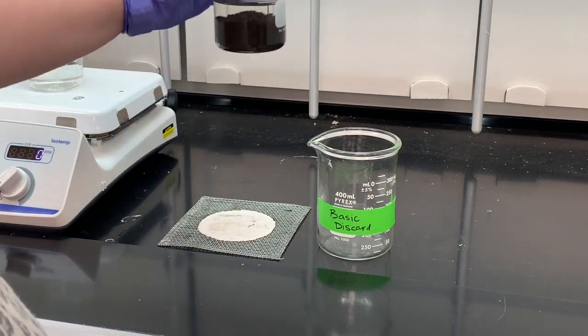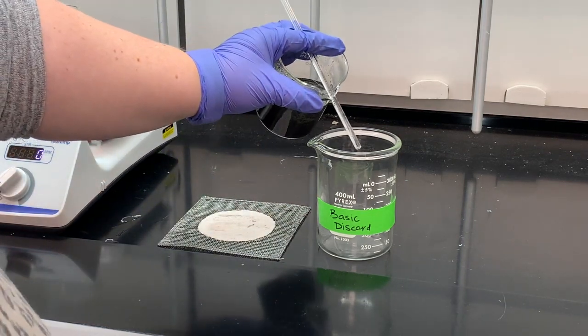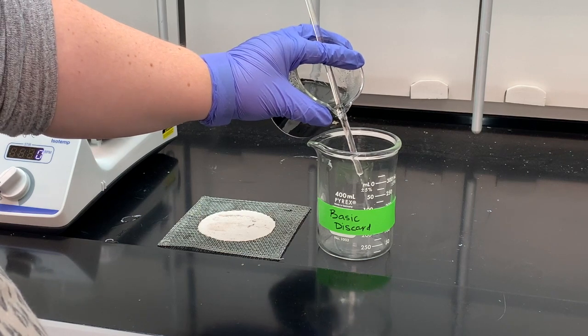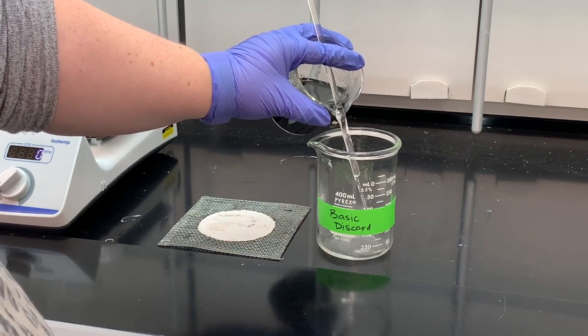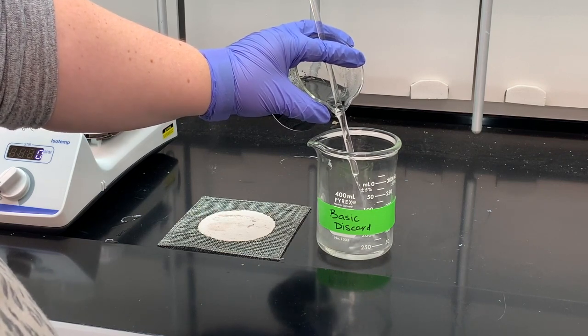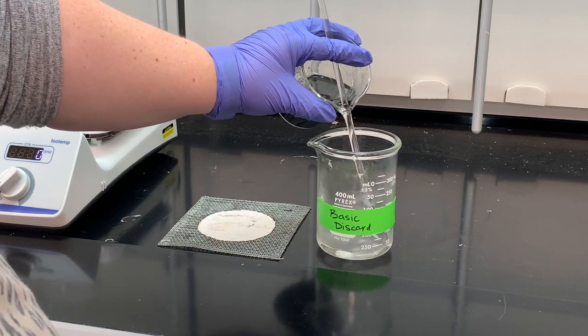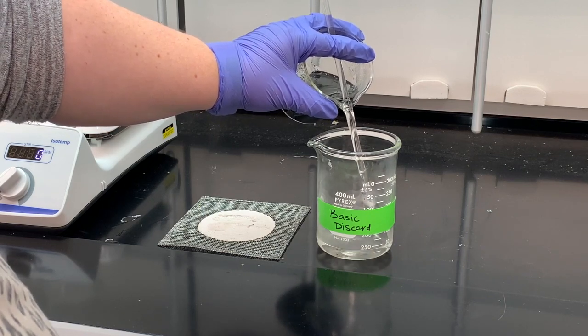But we can get some of that liquid out. So again, just very carefully, slowly pour it down that stirring rod. The stirring rod is to catch any of the solid that may try to come out while you're decanting.